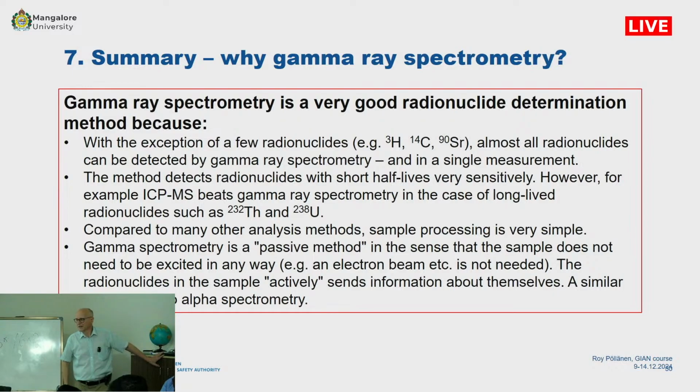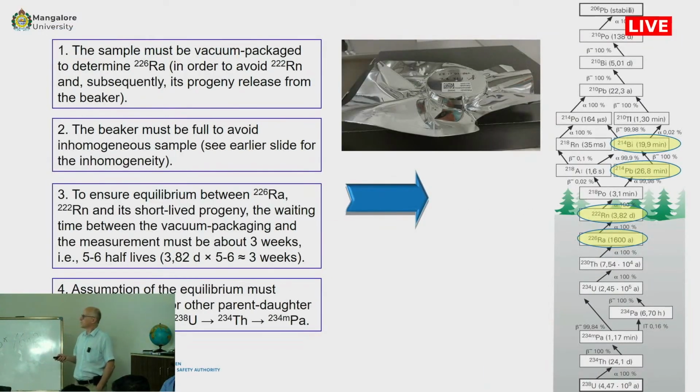Okay. So you showed me the equilibrium between the uranium, thorium and protactinium. Is that ensured in soil samples? In soil samples, I have thought about this a lot, and it depends on the case.